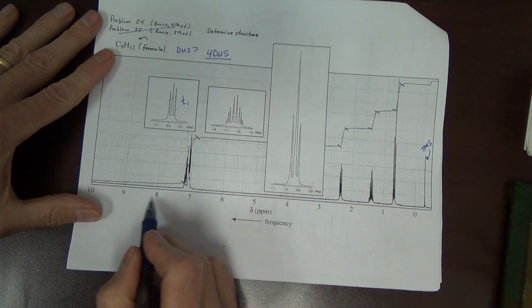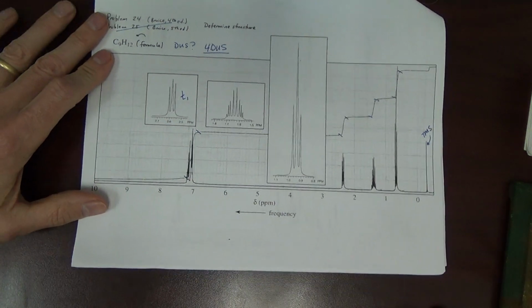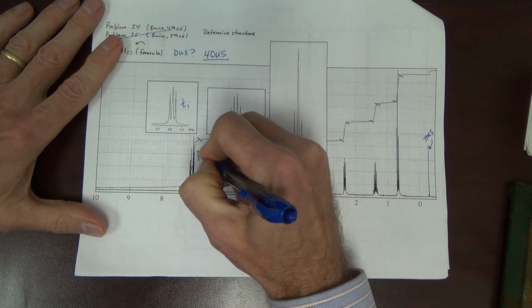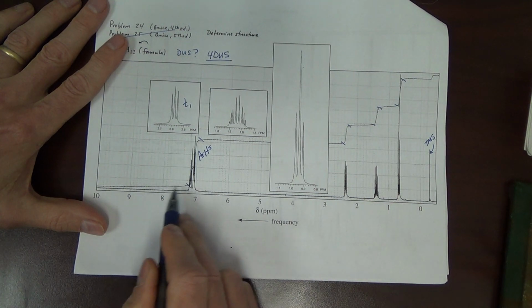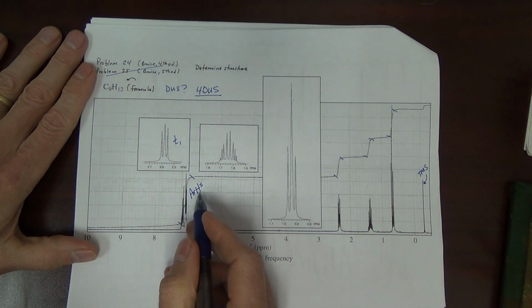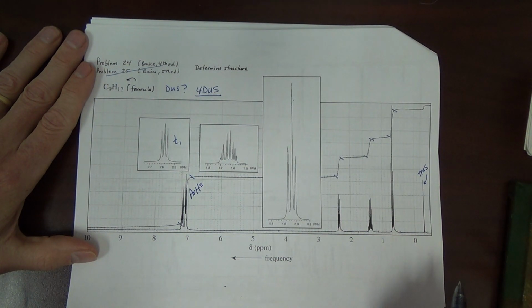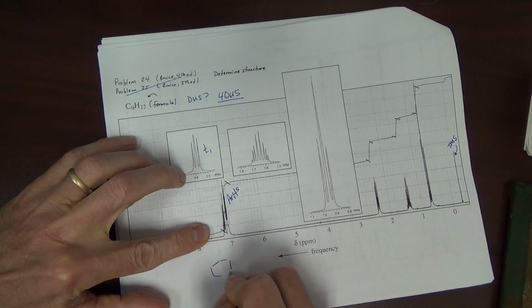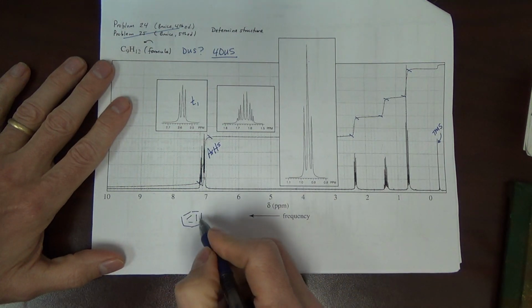But still, these peaks are in the 7 to 8 region. What type of protons give peaks here? And of course the answer, if you've been learning your peak positions, is these are aromatic H's. Okay? H's that are on an aromatic ring will give signals in the 7 to 8 region. Alright, well let's continue with this here. What's the most common aromatic ring? Well, the most common aromatic ring is a benzene ring. Alright, with H's on here.